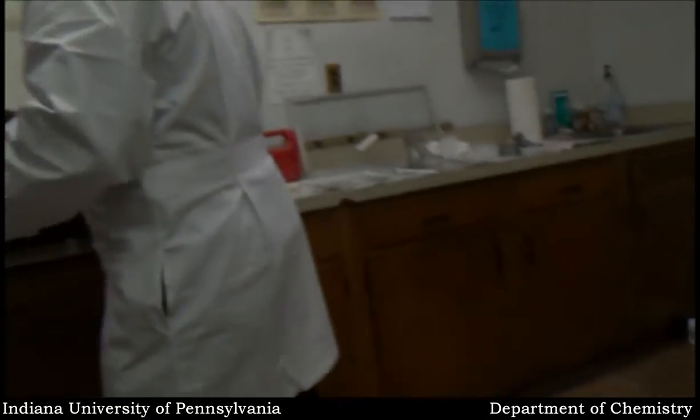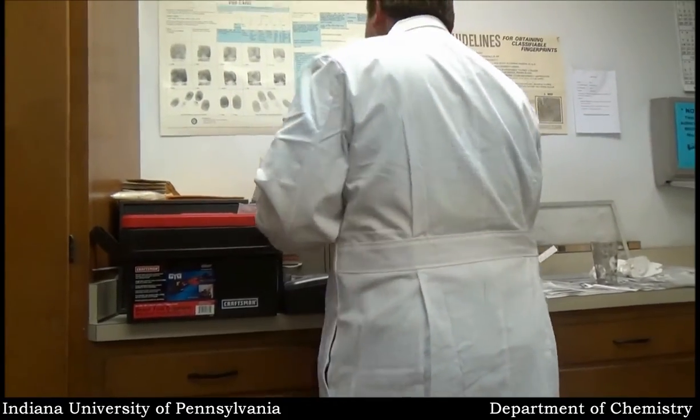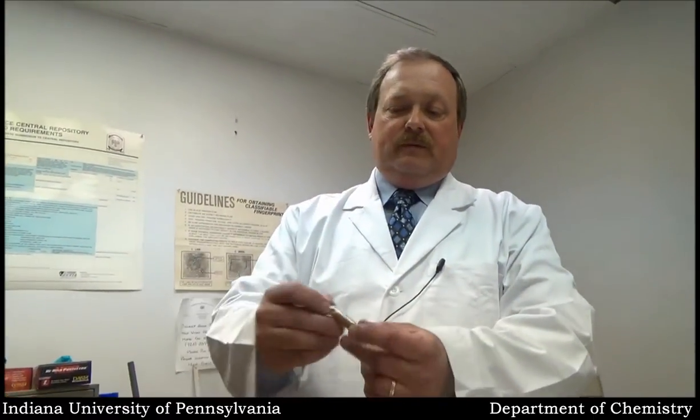Iodine is also available to us in capsules — these come in little ampules. If we were going to use this form of iodine, we would simply break the glass ampule with a narrow neck and dump the iodine crystals onto the paper, sift them around, and as they rolled across the latent fingerprints they would tend to leave behind a similar visible latent — using iodine crystals as opposed to iodine fuming. I've had the most success with the iodine fuming, especially when you're dealing with a threatening or harassing letter that's been sent to somebody.